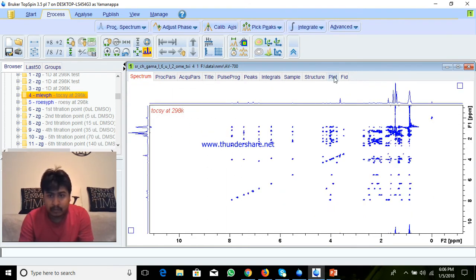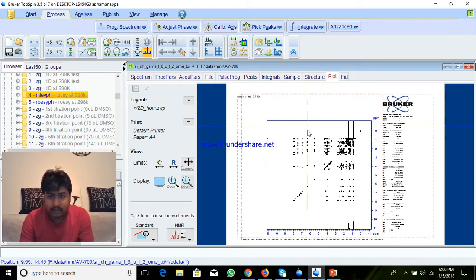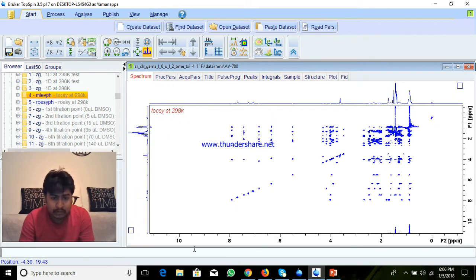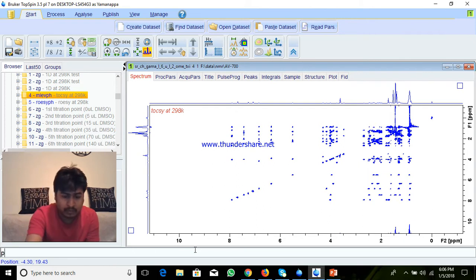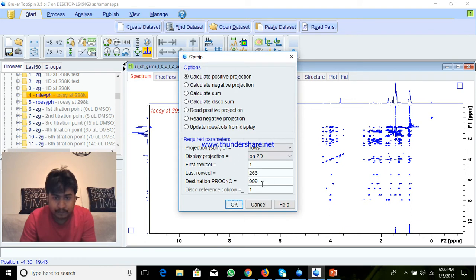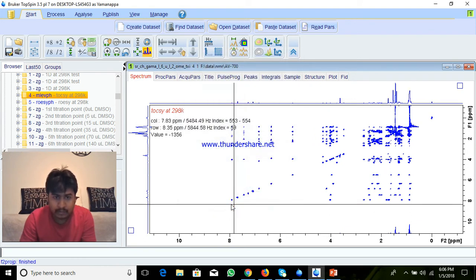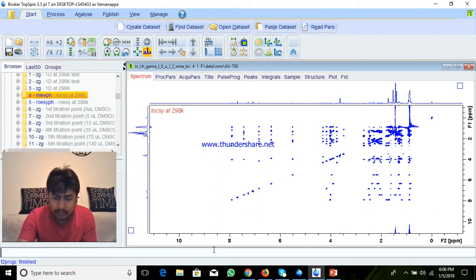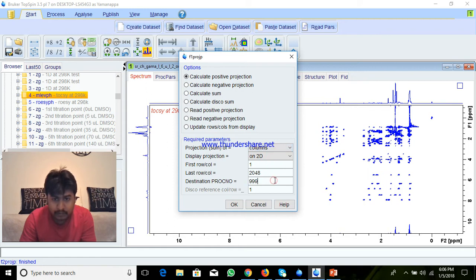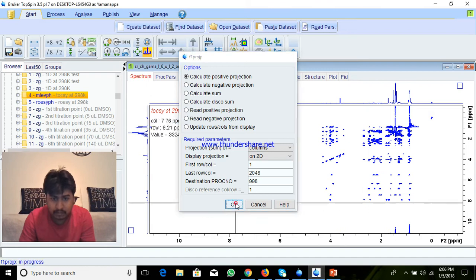If I give a plot directly, I can't get projections here. For that, what you have to do: give the proj command — means projection — and now it's row, and 999 processing, and I will give OK. And again the proj command — you did it for row — and now you have to do for column, then you save this one as another number, another processing number, and OK.